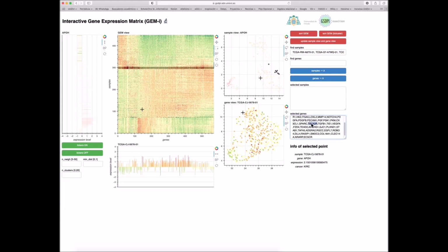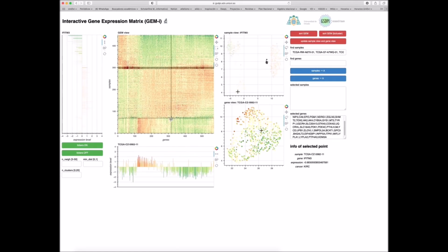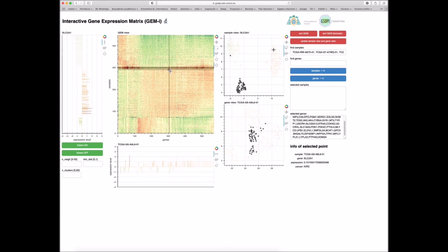However, doing the same for the genes involved in glycolysis, the 3 types of tissues are clearly separated, which means they have different behaviors according to glycolysis. But remarkably, tumors carrying VHL mutations group with kidney tumors, revealing that activation of glycolysis is a feature of this kind of tumors. Down here, group normal tissues. In this area kidney tumors, and here the pheochromocytomas.